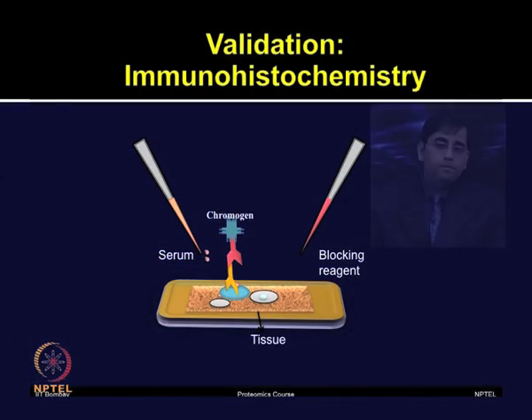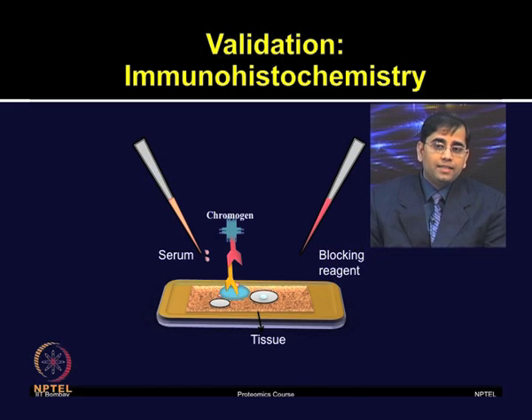The authors also employed immunohistochemistry or IHC for validating the pigment epithelium derived factor PEDF and zinc alpha 2 glycoprotein. So, they are very confident that the proteins they identified from the proteomic profiling are real, and they also tested those on independent tissue samples.